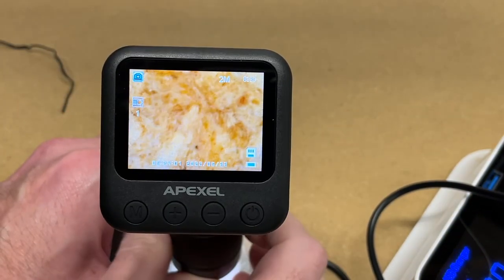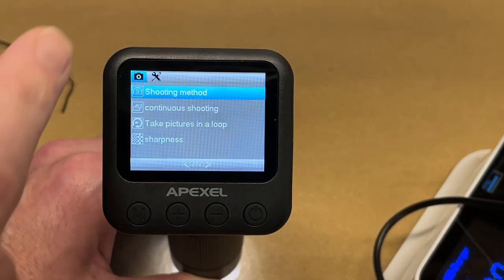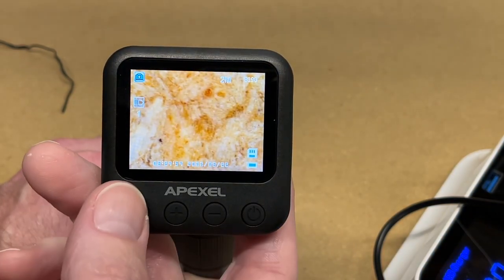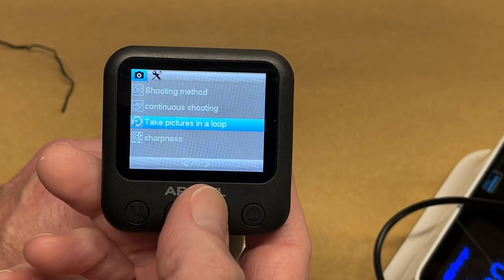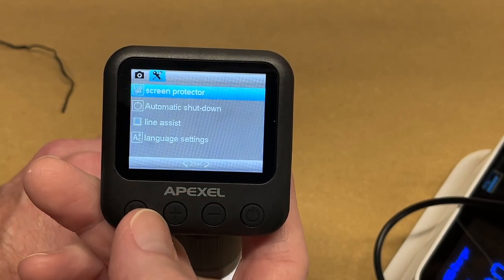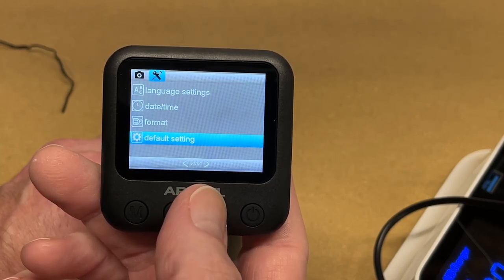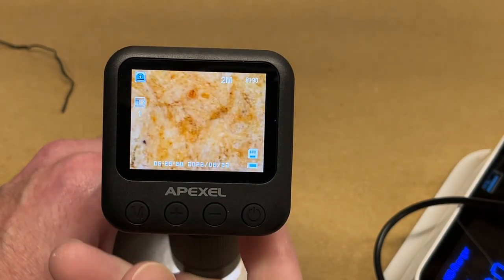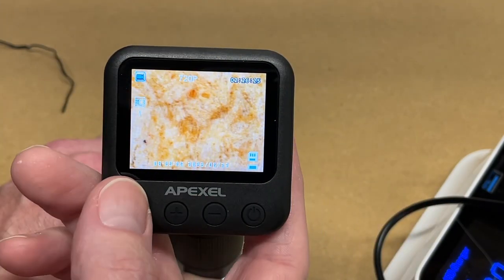If I rotate this we can focus in on the surface — this is just my bench. Let's go into the settings. I'll hold down M. Here we have the photo settings; if we press M again we'll have the main settings, and pressing it again exits. I can press the plus/minus to go up and down through the different settings. We could format the SD card if needed. Pressing M on this screen switches between modes — now we're in video mode, and here's the playback mode.